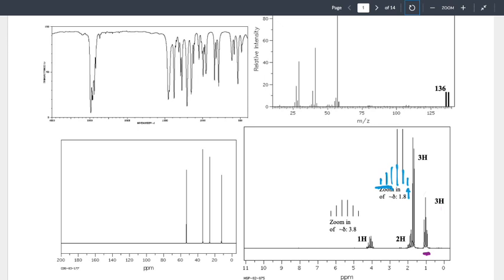Which then sets us up with the interpretation, or almost the interpretation of it, kind of a middle ground interpretation. This is the neighbors, and this is the formula stuff that you were dropping with your powers that I would say we just memorize as a different formula system. We have to figure out our neighbors. There's a formula: neighbors plus 1 equals the number of peaks. So what does that mean for us? Multiplicity, this was the number of peaks. This is my neighbors.